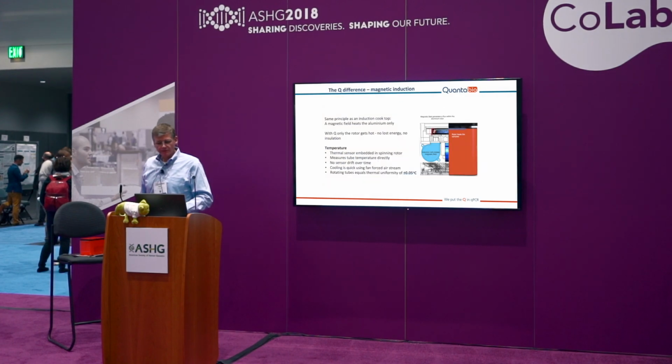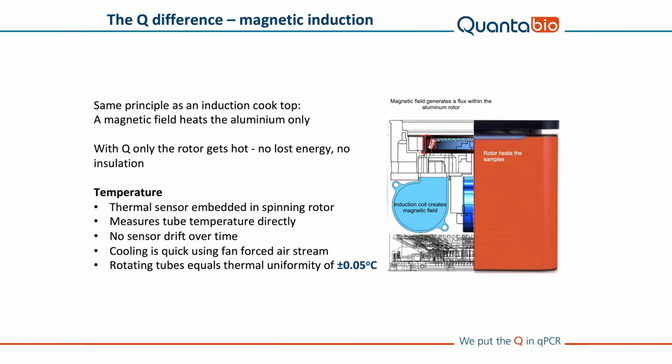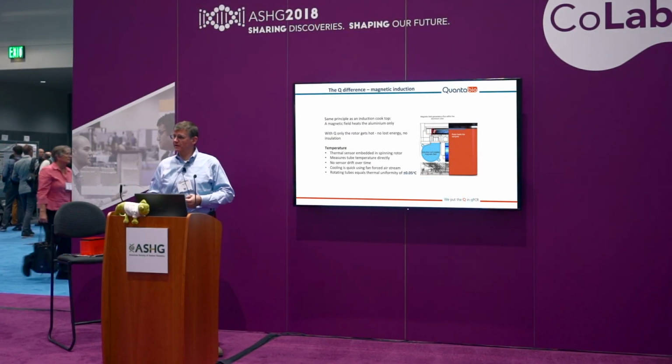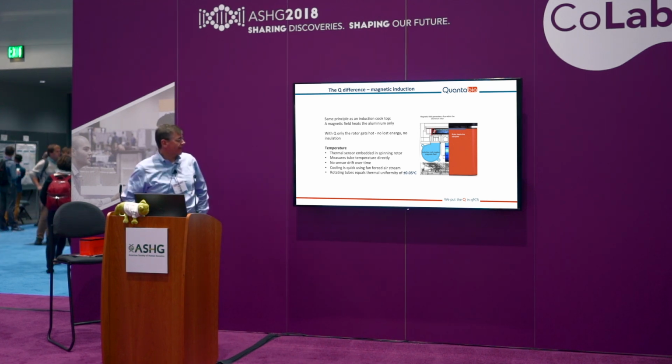So let me take you through some of the principles of it. Again, as I mentioned, it heats by magnetic induction technology. So the rotor being used contains the samples. As this spins, it goes through this magnetic coil, and that then induces the field, and the rotor gets hot with no loss of energy. So there's no need for a lot of insulation around this. And again, as it then cuts off the magnetic field, the rotor cools based on just fans.